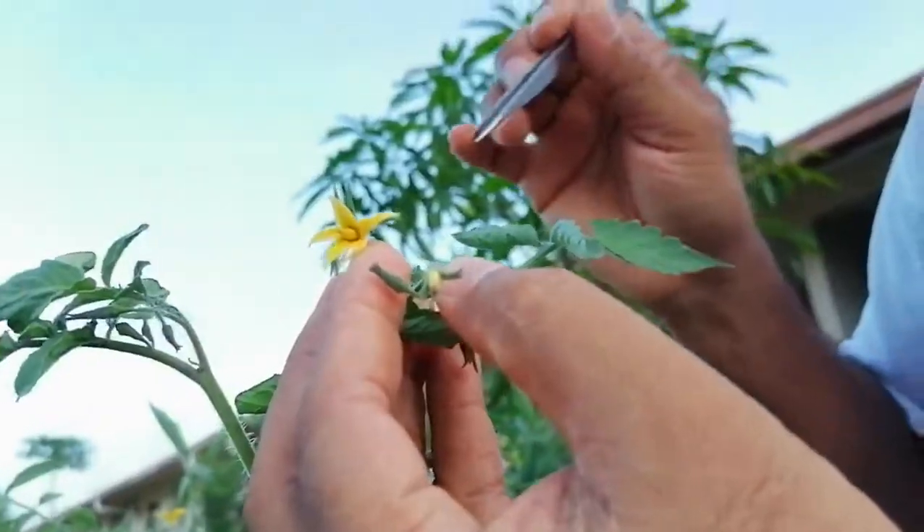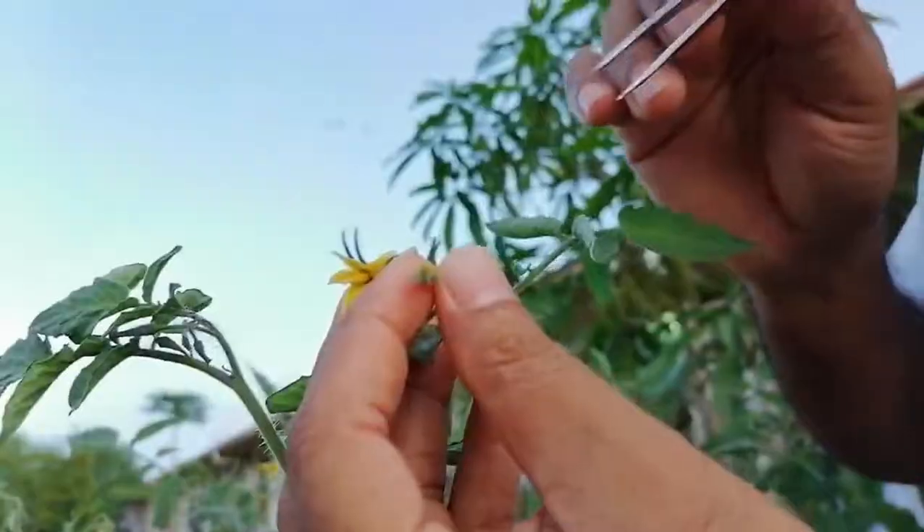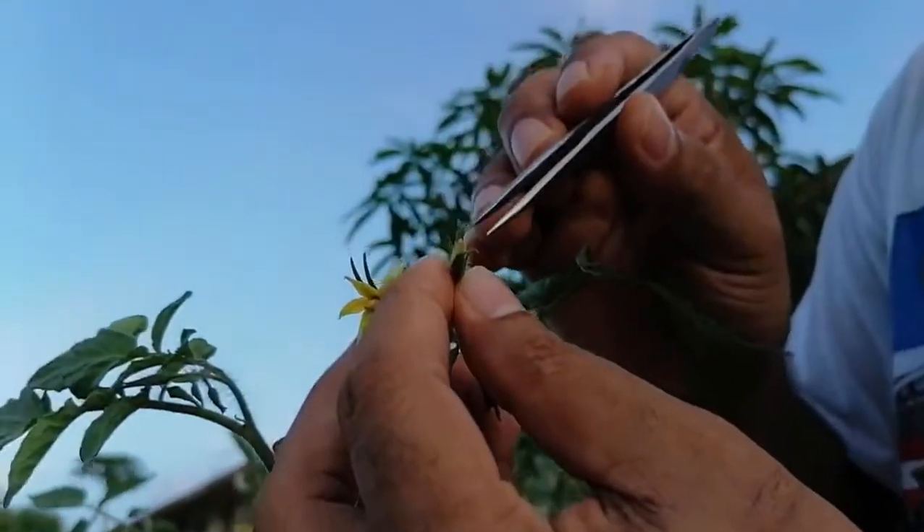We cannot use an already-opened flower. We have to use a flower like this that is not yet opened. Suppose today is about evening — before that we can do the emasculation, and tomorrow morning when we see many flowers already open, that is when we can pollinate.